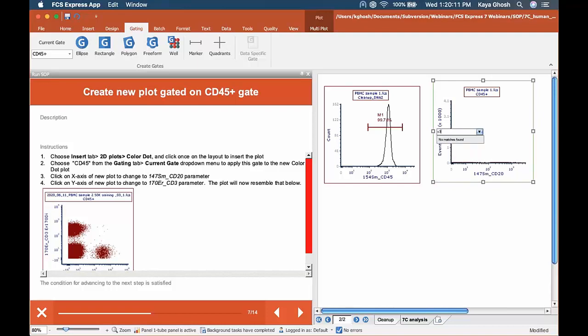So a lot of these steps I'm showing you are relevant even to a quality or clinical environment. This is just basic plot building, right? So hopefully there's a little something here for everybody, no matter what environment you're in.